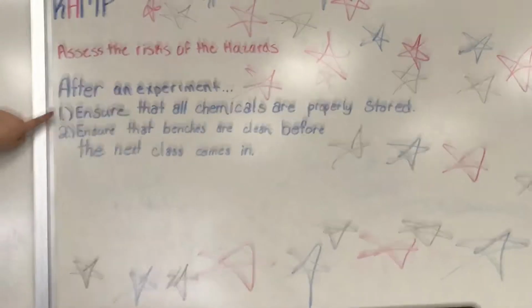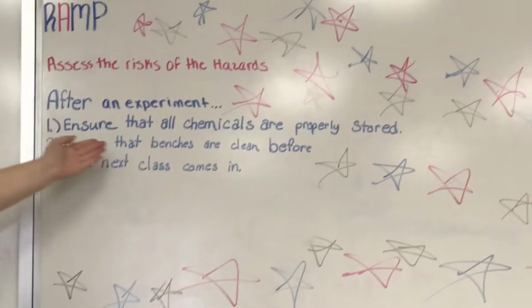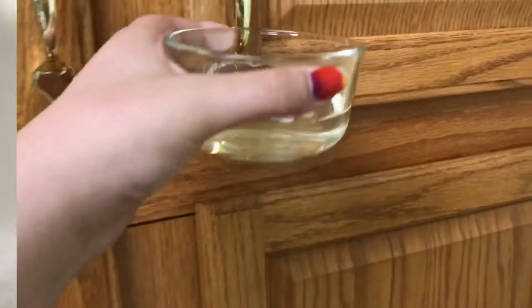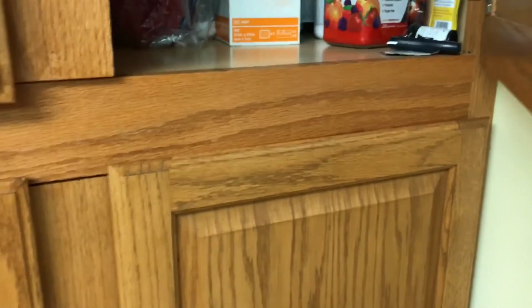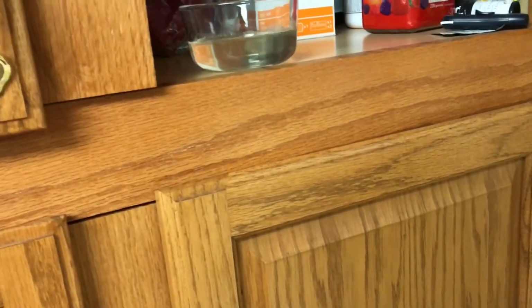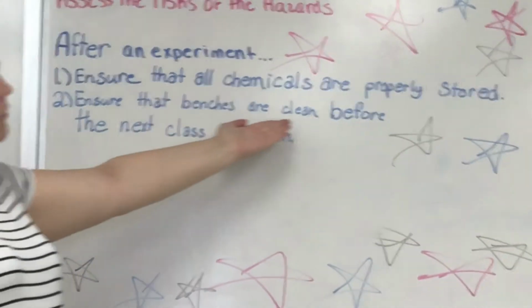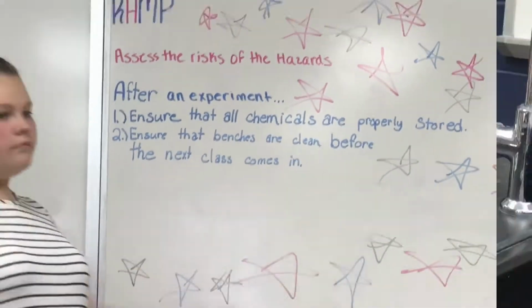After an experiment, ensure that all chemicals are properly stored. Ensure that benches are clean before the next class comes in. Is it clean? It's clean.